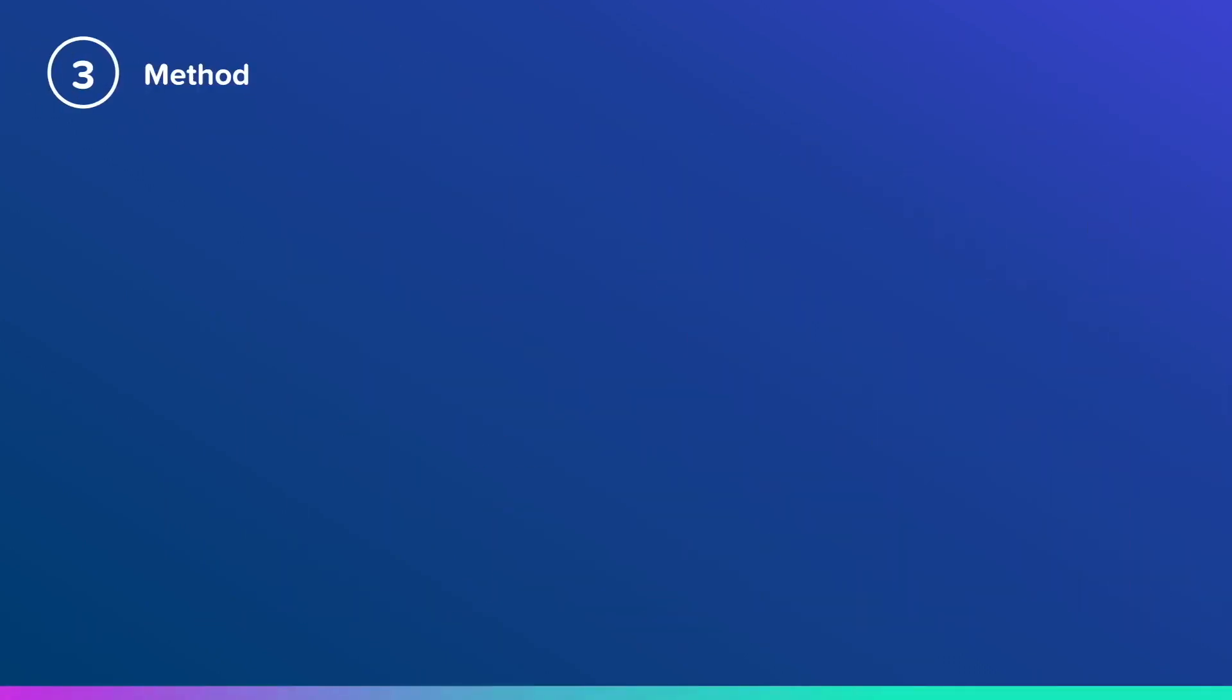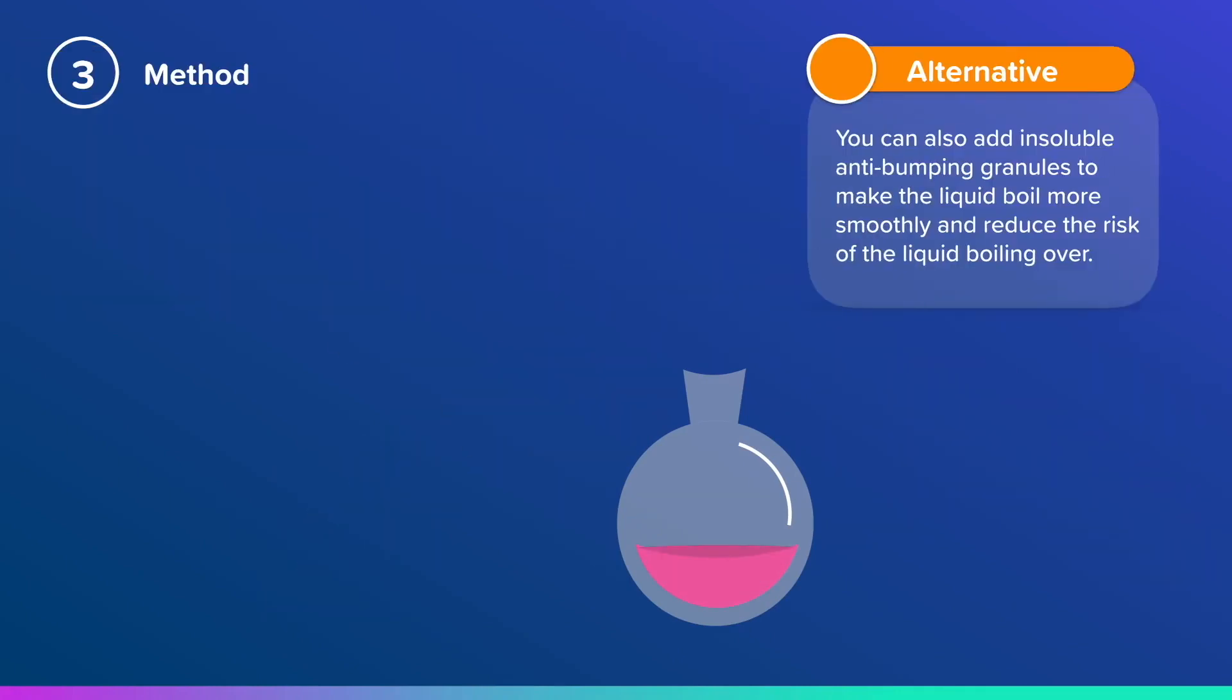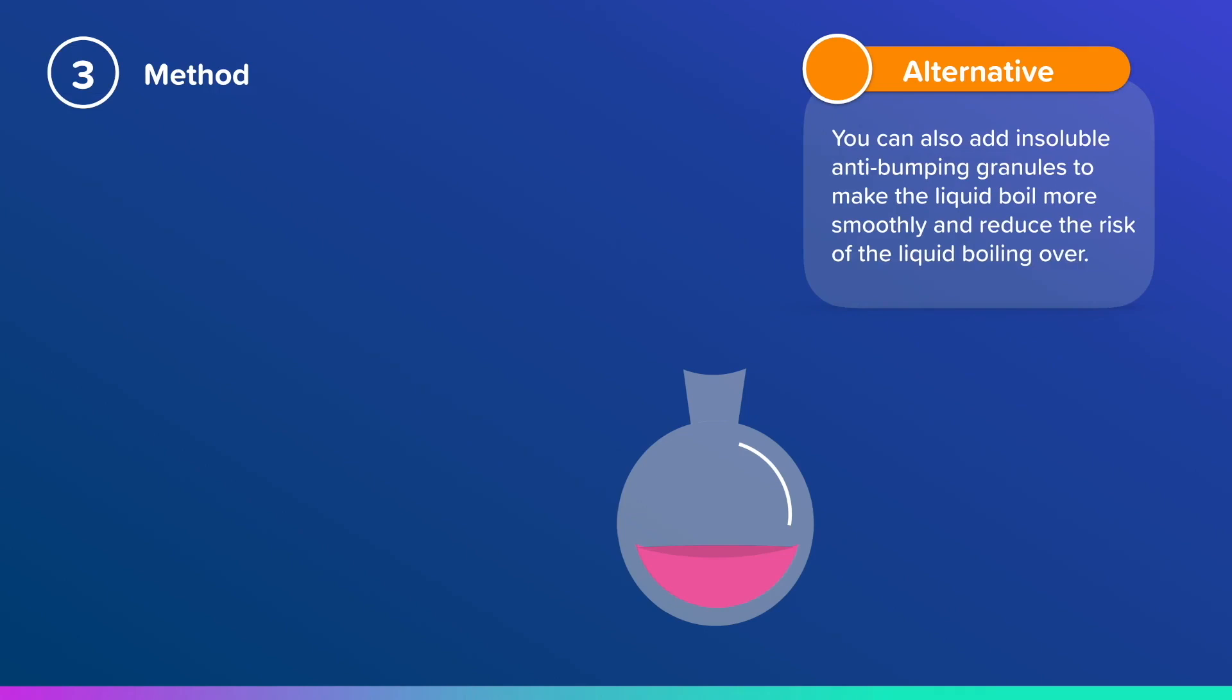First, add the liquid you're going to distill to your round-bottomed flask. You can also add insoluble anti-bumping granules to make the liquid boil more smoothly and reduce the risk of the liquid boiling over, but it's optional.